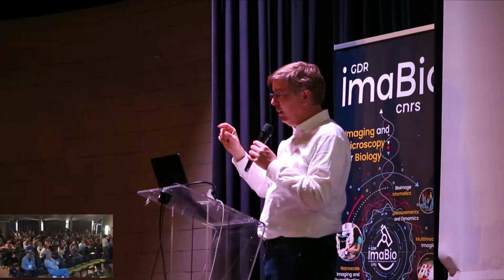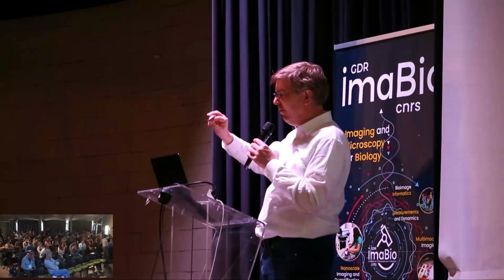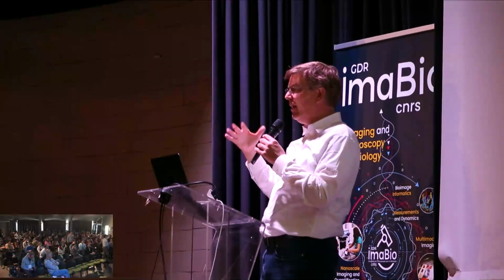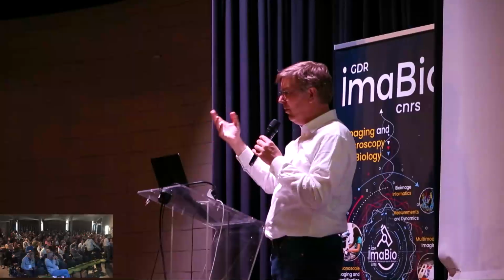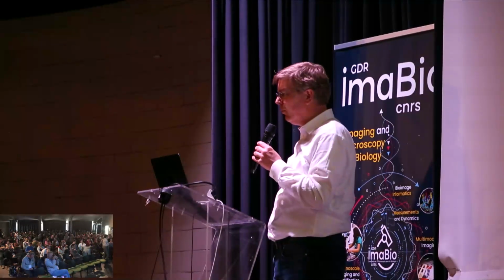Nanobodies help, using smaller probes there. For the DNA-PAINT probes, we often put the dye at the end facing the nanobody rather than the other side. But in practice, the rotational flexibility is fortunately averaging out many of these problems. Thank you.